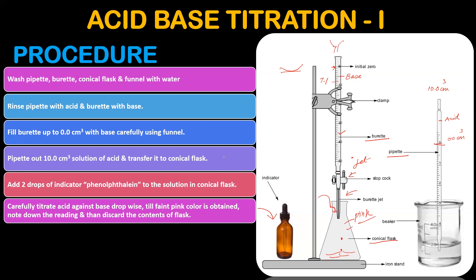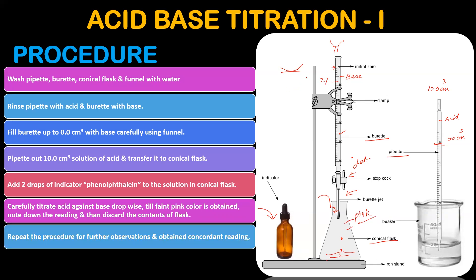We will wash the conical flask and repeat the process. The burette only needs to be refilled if necessary, but the pipette solution will always be freshly filled. We will repeat the titration and record a second reading — for example, 14.4.